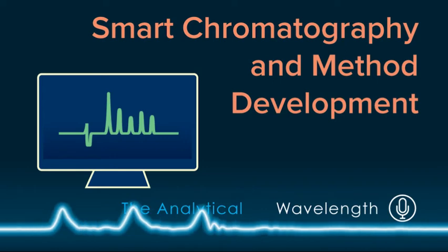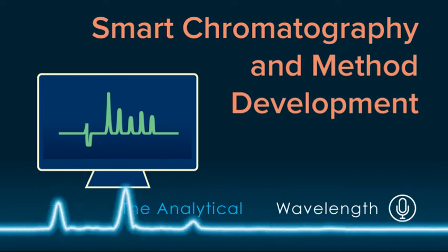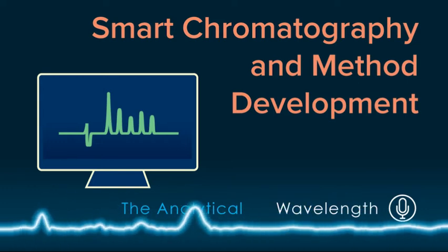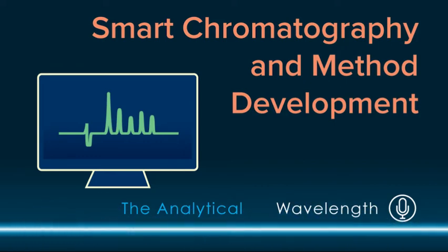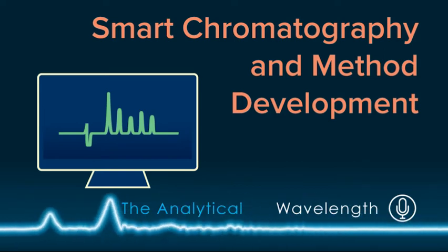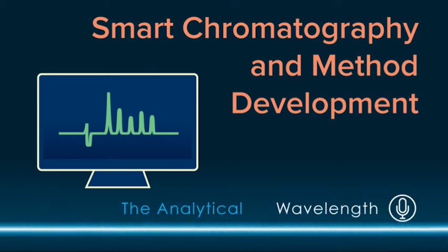fundamentally different, in that it allows the opportunity for you to basically democratize chromatography method development. You don't need to have a PhD in chromatography or have done it for 25 years to develop completely adequate and acceptable methods. But that's a double-edged sword, right? By democratizing that, anybody can do it, but what happens when it falls over is ultimately the question that comes about. And so without that trained expertise or some inherent knowledge of what separations actually do, you can really get yourself into some deep water pretty quickly and not be very successful.